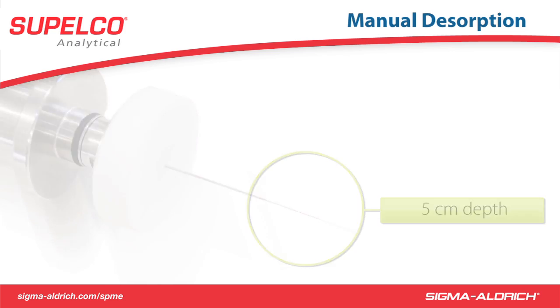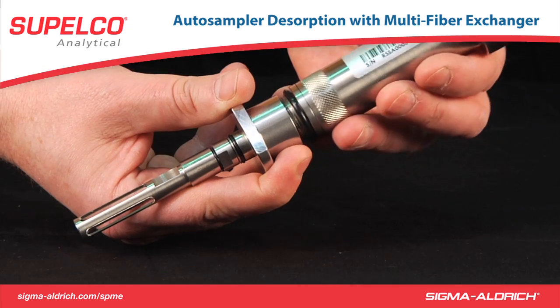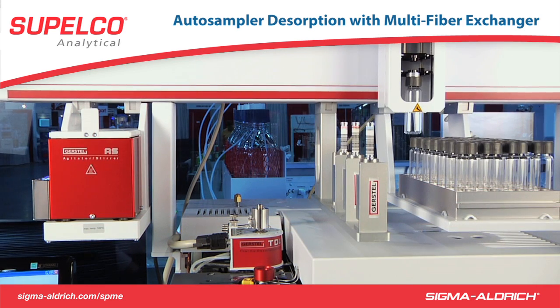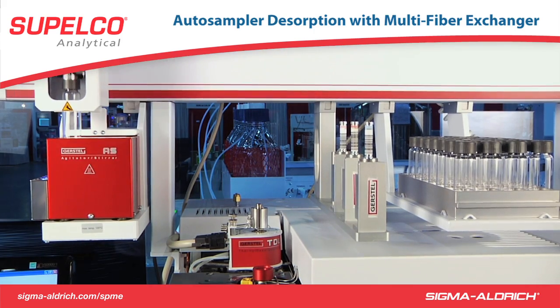Alternatively to manual desorption, the FFA can be taken out of the holder and placed into the tray of the Gerstel MPS Multi-Fiber Exchange System, or MFX, on a CTC type autosampler. The standard MFX tray is equipped to hold up to 3 FFA fibers.